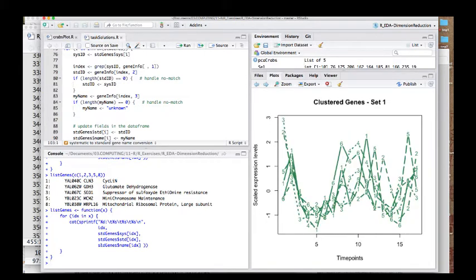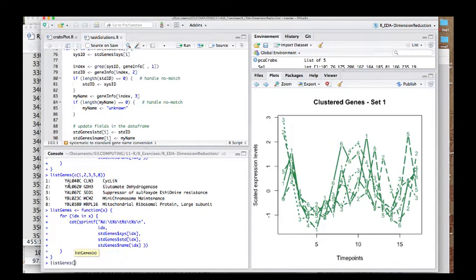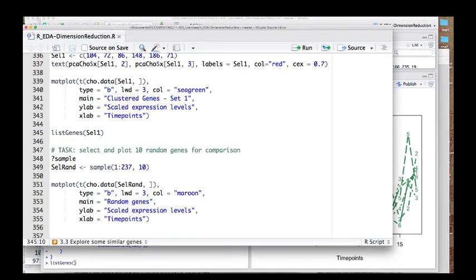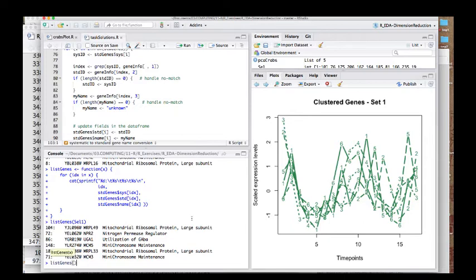Our gene sets were set 1 and set 2. Let's use our new list_genes function and see what we get. That's already in the code — list_genes on cell 1. So we have a mitochondrial ribosomal protein, another mitochondrial ribosomal protein — it makes sense those two are co-regulated — a nitrogen permease regulator, a protein that utilizes GABA, and two proteins for mini-chromosome maintenance. These co-regulated genes are annotated with similar functions.